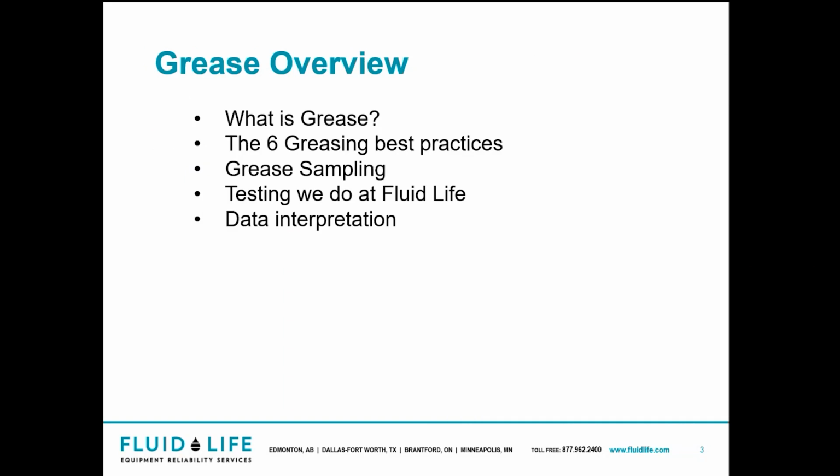So a few topics we're going to cover here today. We're going to cover what is grease, the 6 best grease practices, how to sample grease, testing we do for grease at Fluid Life, and just touch a bit on data interpretation.